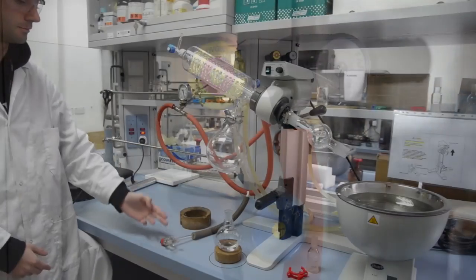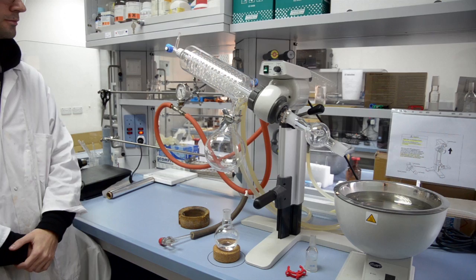The Vacuum Tap. This creates a reduced pressure to allow solvents to evaporate quickly.